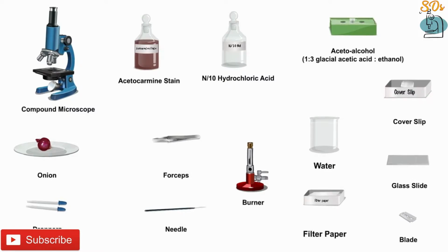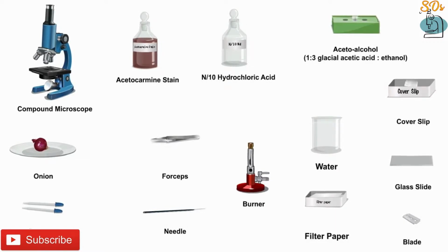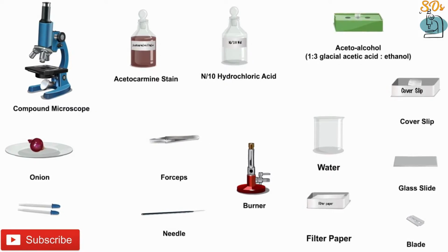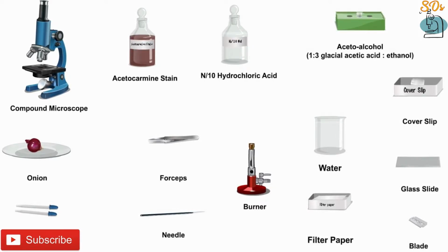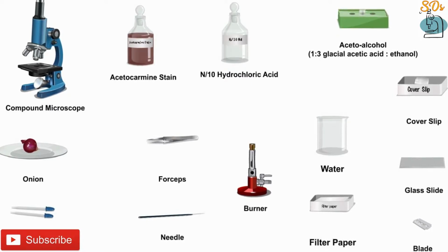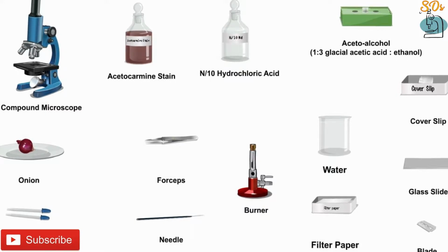First, we have to know what's required for this experiment, mitosis in onion root tip study. Number 1, a compound microscope. Number 2, acetocarmine stain. Number 3, water. Number 4, burner. Number 5, N/10 hydrochloric acid. Next, filter paper, cover slip. Aceto-alcohol, which means glacial acetic acid and ethanol in the ratio of 1:3. Glass slide, onion root peel, forceps, blade, watch glass, dropper, needle, vial.